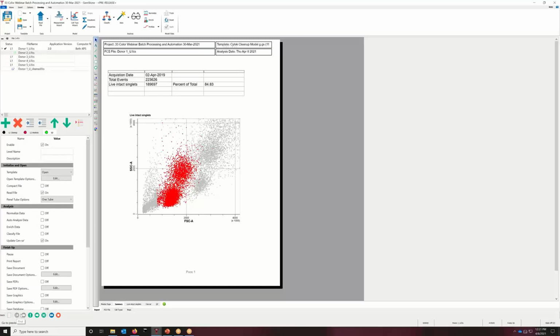You also have go to the first item, previous, you can run the current item, you can click next, run the next item, again, the last item. This is auto advance, and then you can stop doing analysis altogether. The other thing that you can do is double click on a previously analyzed file and then bring up the analyzed document. So that would be one way to open an analyzed document.